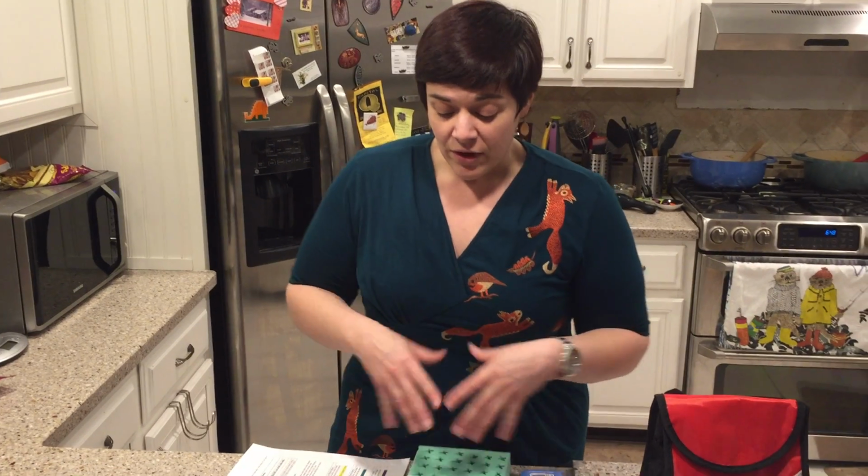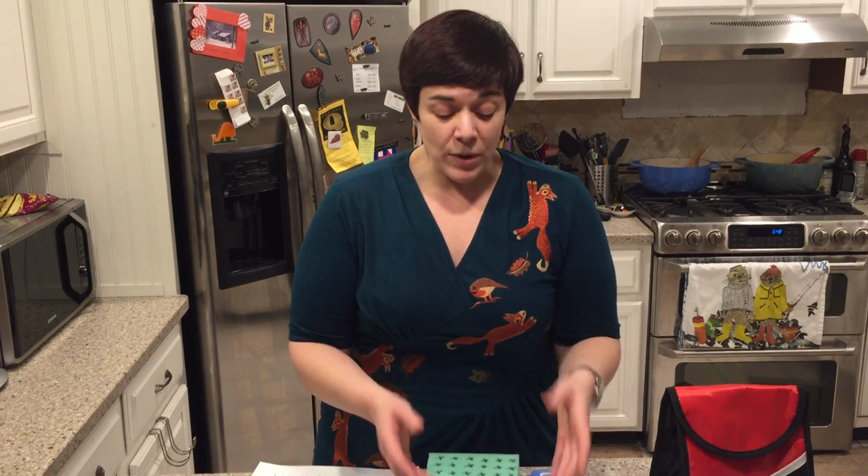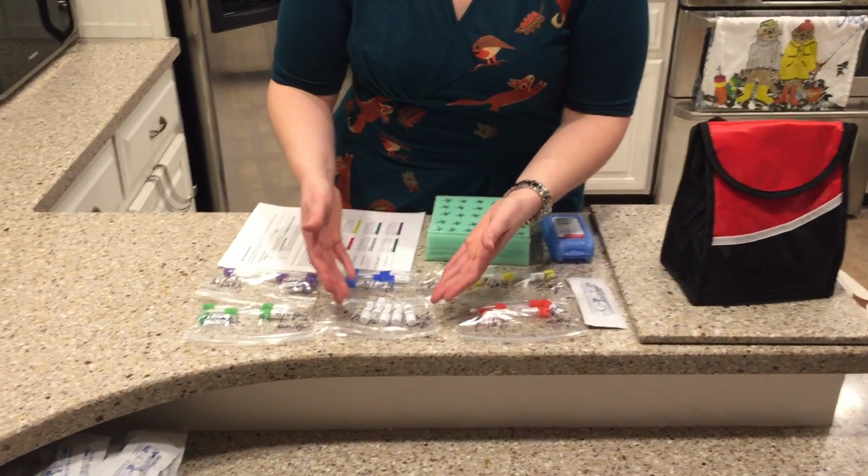And those text messages are going to remind you to collect your saliva at each of those times throughout the day. So when you actually do want to collect the saliva, those text messages will tell you, you have to do your first sample and you're going to only be spitting in the red capped bottles today or the white capped bottles today. Each day is assigned a color. You don't need to know it. I will text it to you that day.